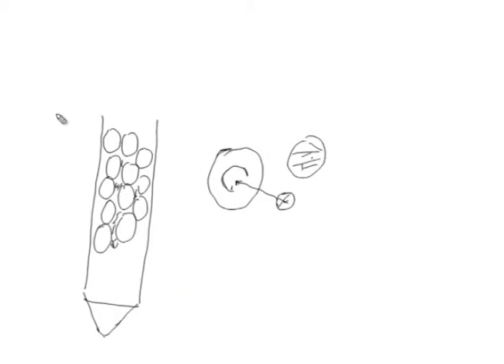So, this will come very fast, but the smaller molecule will spend more time because it will go back and forth as it travels down the column. It will move back and forth into the stationary phase and then the mobile phase. So, if you compare different sizes of molecules, there is one size, there is another size, there is a larger size, then all of these molecules, according to their molecular mass or molecular weight, will spend relatively different times: the smaller the longest time, the largest the least time, and in between they will be spending different times as per their size.